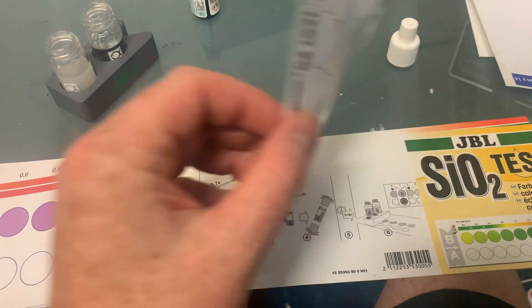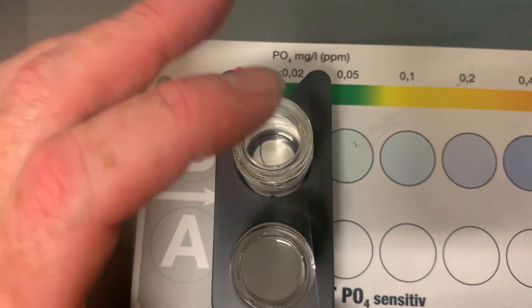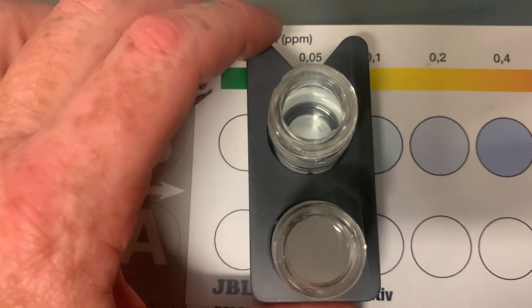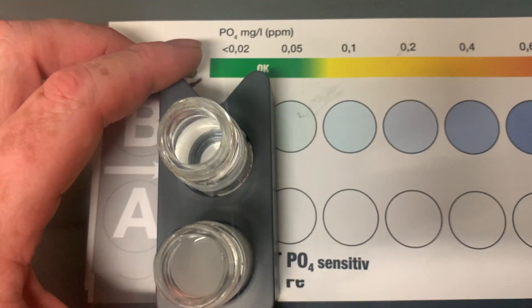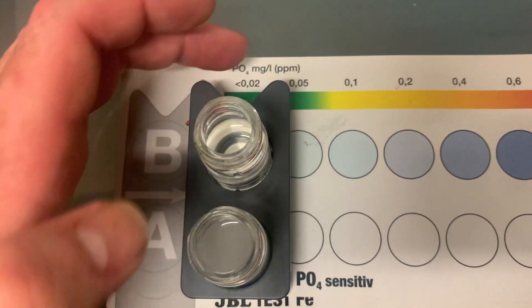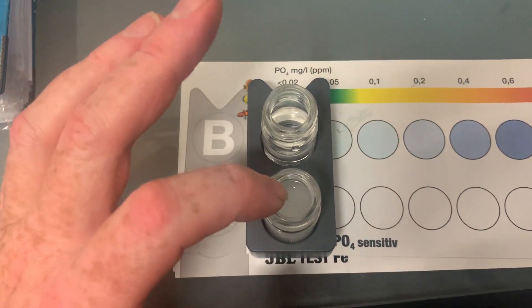I'll tell you a bit about phosphate and what to do after the 10 minutes. I've taken this from a reef tank, so the phosphate level is very low. I won't call it zero because it's not white like that, but it doesn't have much blue either — it's got a bit of grey. So the colour is basically between these two. But you really do need to do this comparison after the full 10 minutes for an accurate reading.